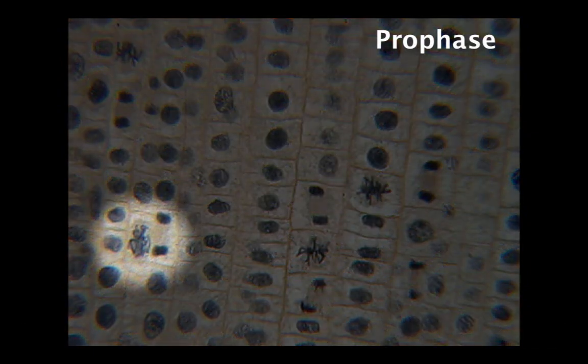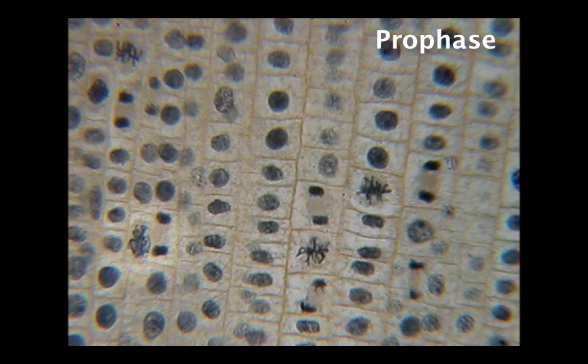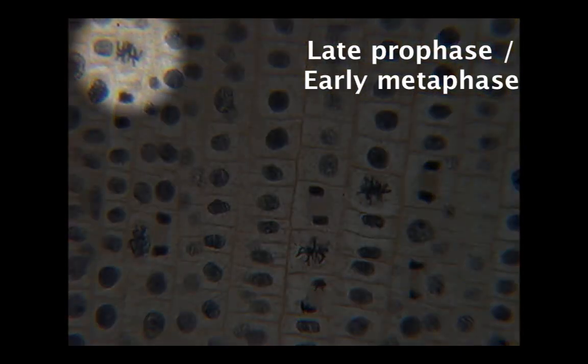Firstly, here we can see a cell that is going through prophase. Up in the top left hand corner, this cell is probably in late prophase or early metaphase.